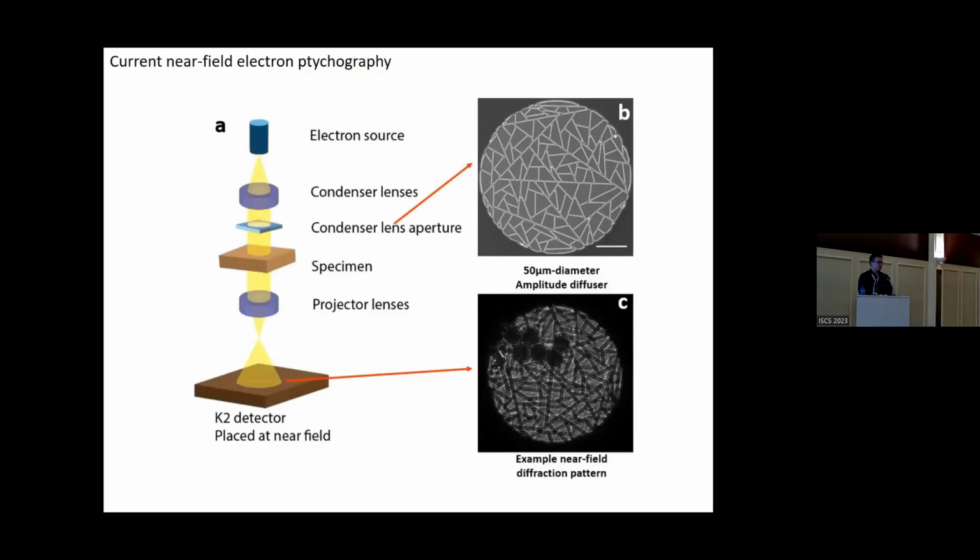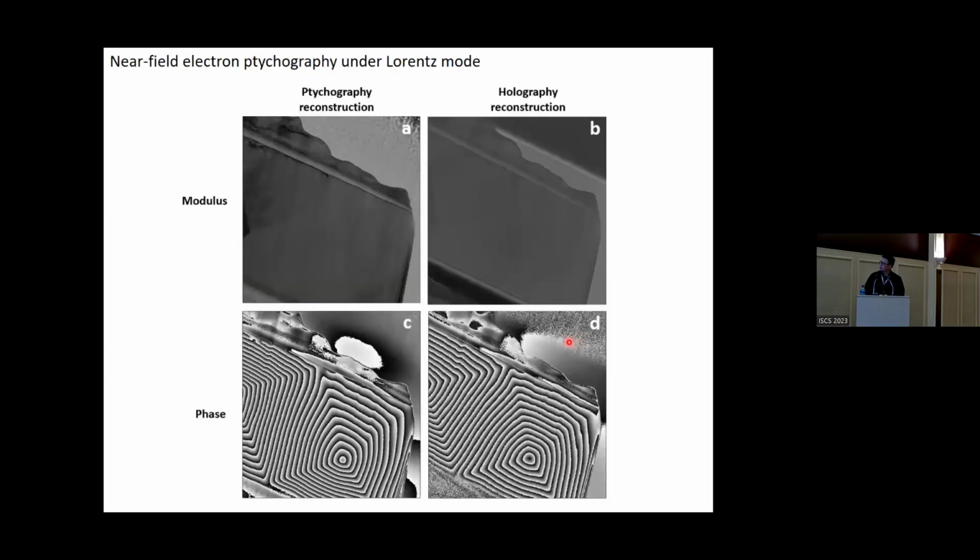Is there any other question? In the last few results that you showed, you can reconstruct the phase quite accurately. I was wondering, would there be any gain for your application if you would also be able to unwrap the phase? So here you're bounded by pi to minus pi. Would there be an interest in unwrapping it?